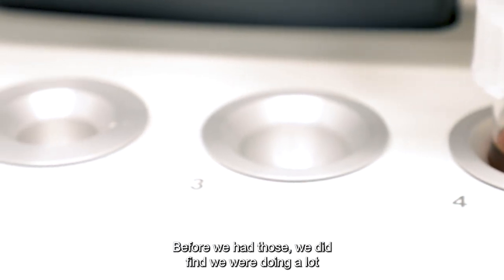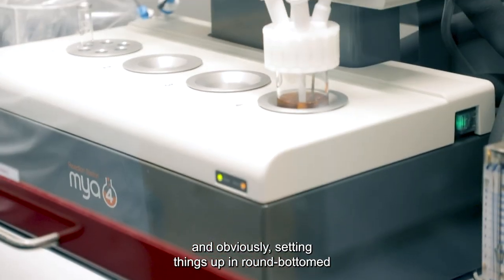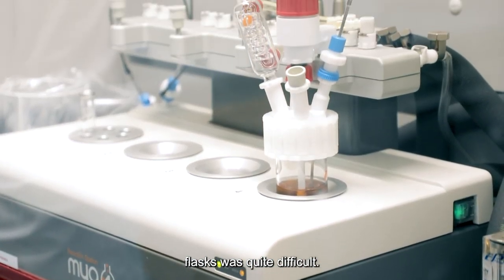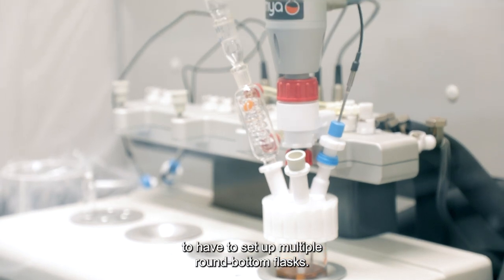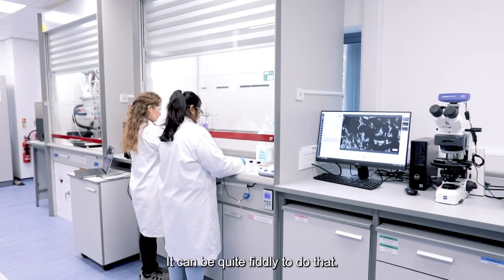Before we had those we did find we were doing a lot of one-off experiments and obviously setting things up in round-bottom flasks was quite difficult. It's a lot of space for the scientists to have to set up multiple round-bottom flasks. It can be quite fiddly to do that.